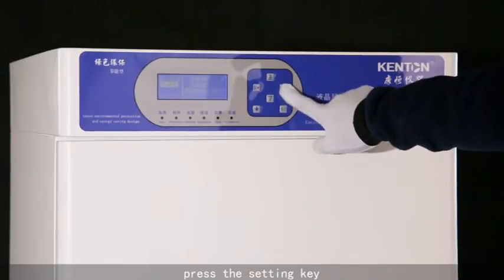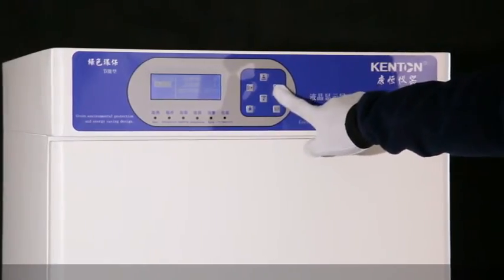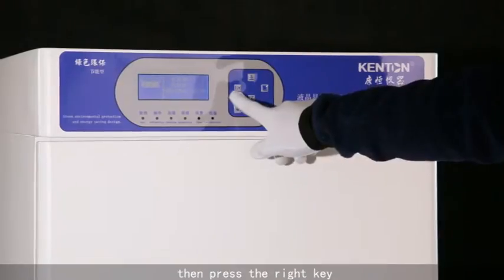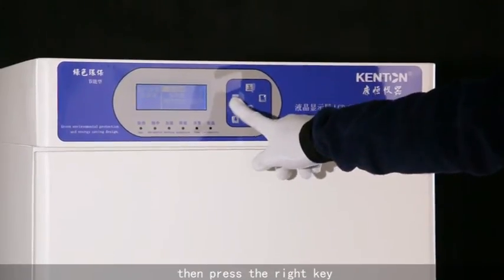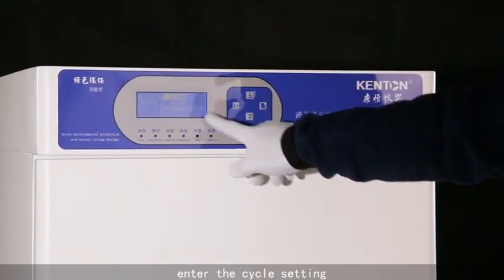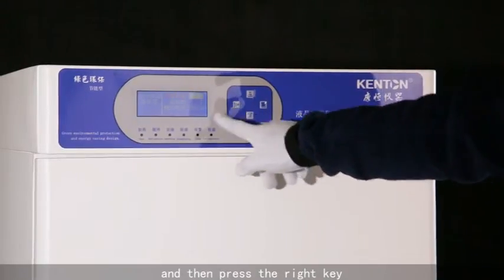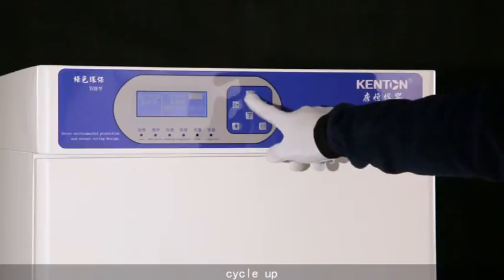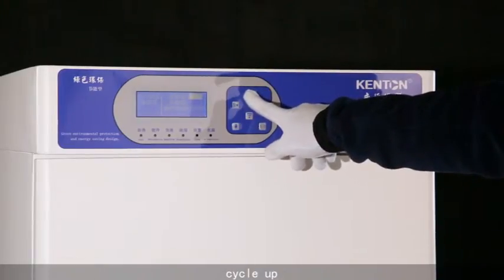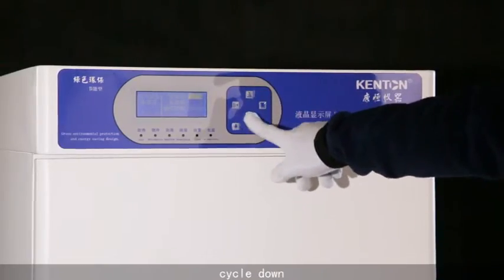Press the setting key, then press the right key. Enter the cycle setting, and then press the right key. Cycle up, cycle down.